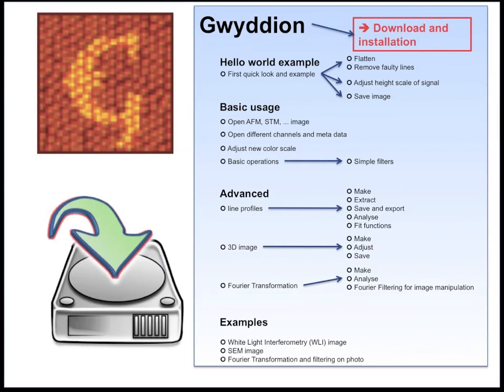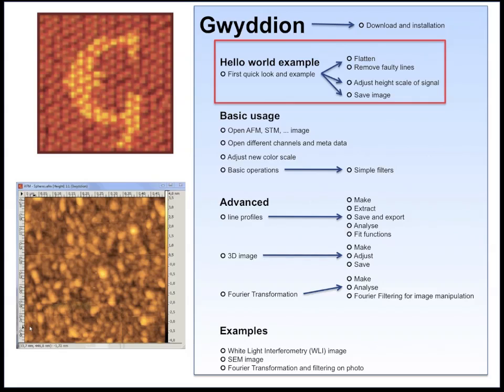First, I will show you how to download and install the software. Then I will show you a first quick example in which I will open an image and perform some rudimentary operations such as flattening, removing faulty lines, adjusting the color scale, and saving the image.